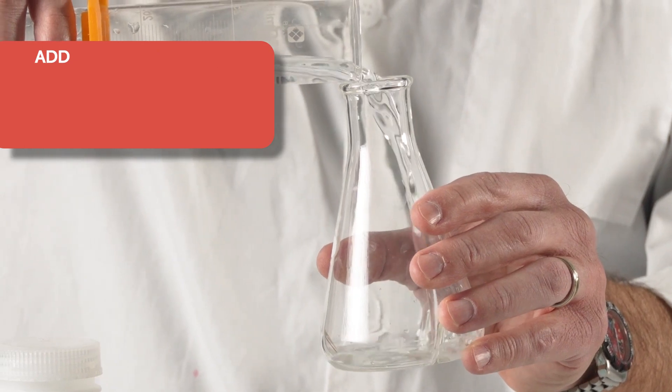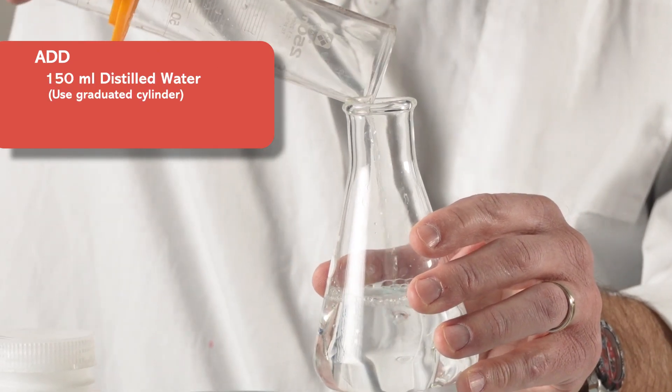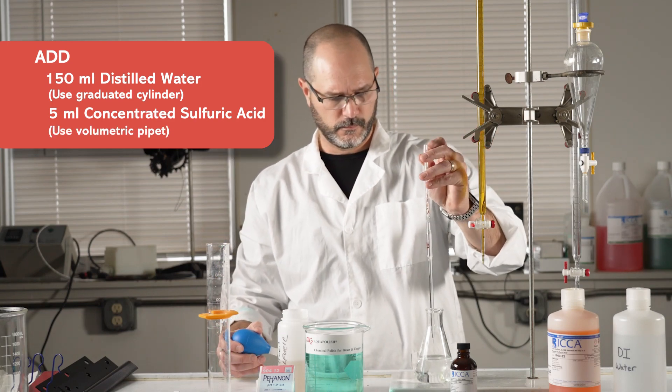Next, add 150 mL of distilled water using a graduated cylinder and 5 mL of concentrated sulfuric acid with a volumetric pipette.